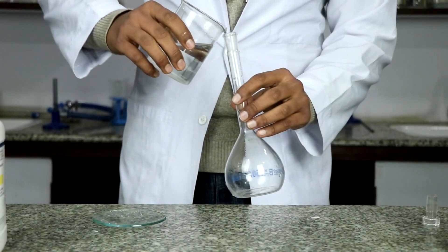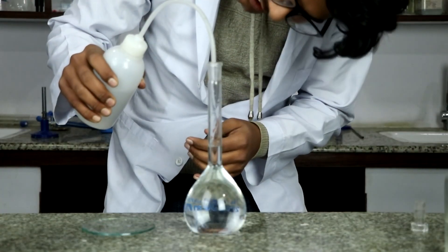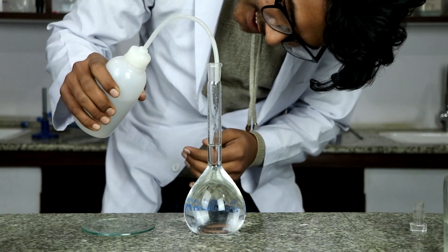Transfer this acid to 250 ml volumetric flask and then add a little distilled water, shake it, and finally add distilled water up to the mark to produce 0.1 normal oxalic acid.